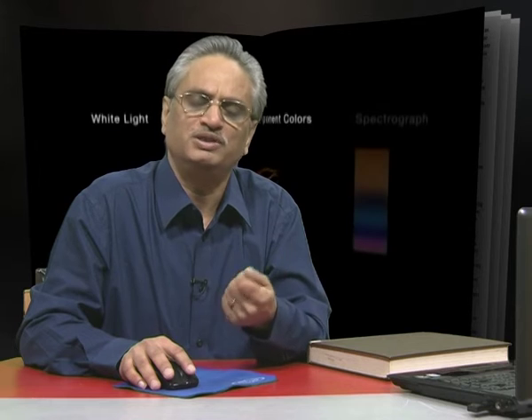That means you have to have a source, a sample holding device, and some kind of monochromator, whether put after the source or after the sample has been interacted with. Then you need a device to detect the consequence of interaction between the radiation and matter. And towards the end we need some kind of interface which can give you an output. I am sure I have put before you the different kinds of setups we can use to study the interaction of radiation and matter, that is, spectroscopy or spectrometry.